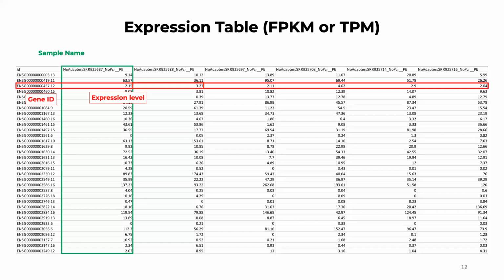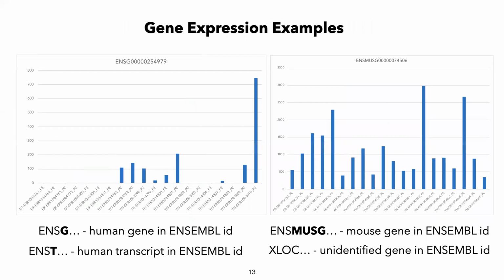And if you look at a profile of a gene, what we call a profile of a gene, you can tell what gene it is by the name. For example, we used Ensemble ID. If you are working through Transcriptomics 1, there's a data set there that contains genes from both mouse and human. In our case, for cell lines, we're only using human. But here you can see that the extension ENSG or ENSMUS-G gives you a sense of which reference genome was used to quantify that gene expression.